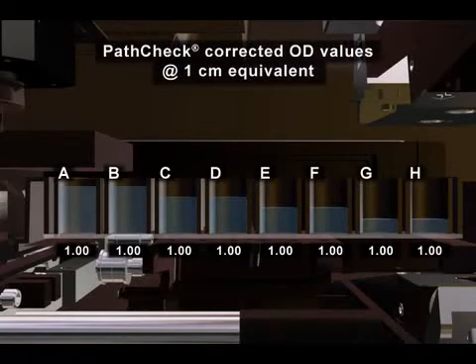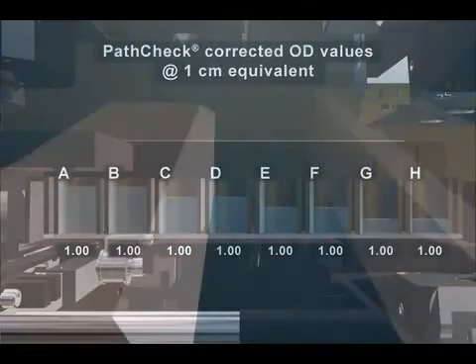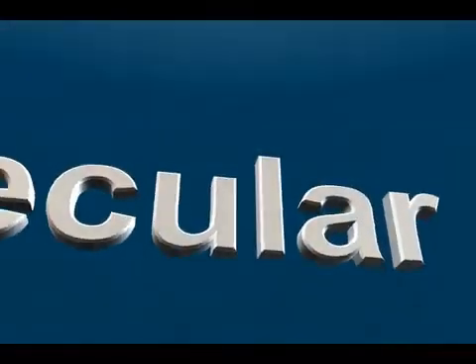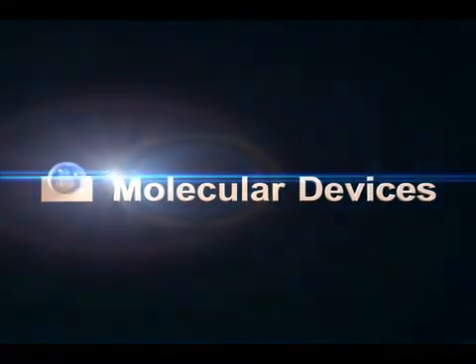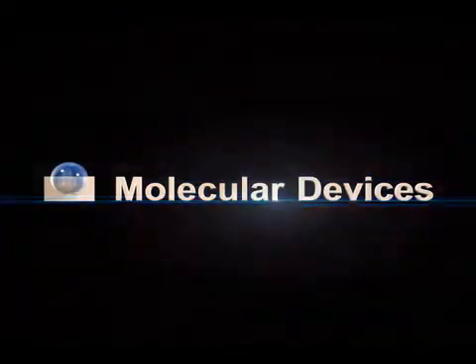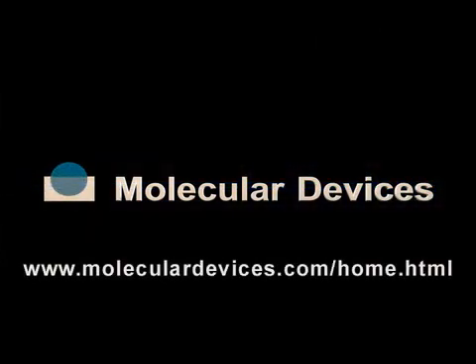These unique features, along with luminescence, TR-FRET, and HTRF capabilities, make SpectraMax an indispensable tool for the lab. Please contact your molecular device's representative for additional information.